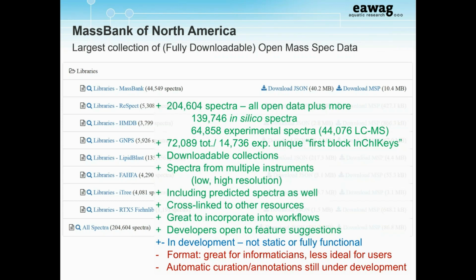As I've mentioned, these are fully downloadable collections. We have spectra from multiple instruments, low and high resolution, predictive spectra. They have great cross-linking to other resources, and MoNA is actually really great to incorporate into your workflows. The developers are really open to feature suggestions, and this is again a plus and a minus. Although MoNA is in development, it's not static or fully functional, but you have the ability to actually change the way that MoNA is working because they're developing it right now.